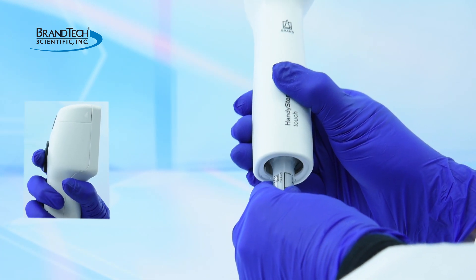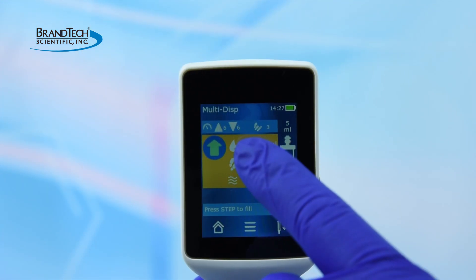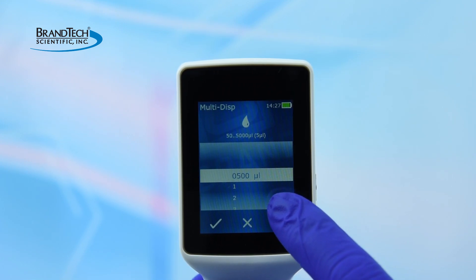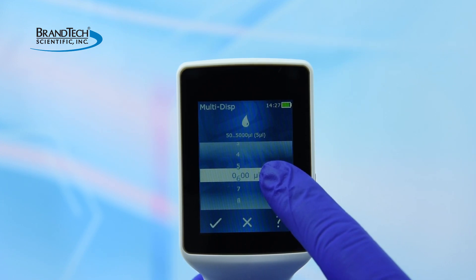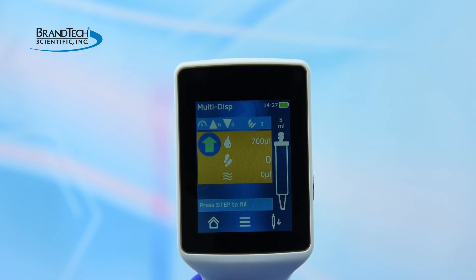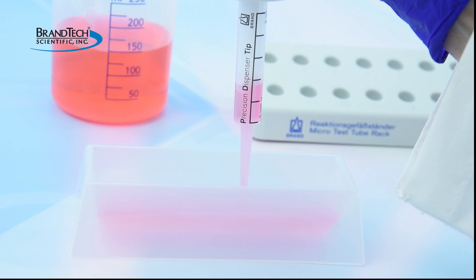Insert a PD-Tip and press the step key to connect it. The PD-Tip volume size is automatically recognized. Set the desired dispensing volume by swiping horizontally and vertically, then tap to confirm. Press the step key to aspirate.